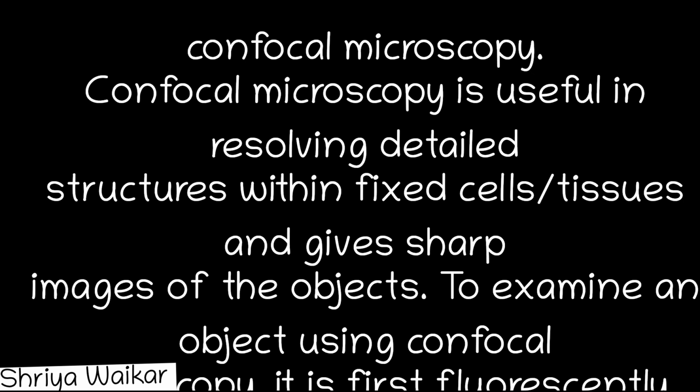The confocal microscope is useful in resolving the detailed structure within fixed cells and tissue and giving a sharp image of the object.